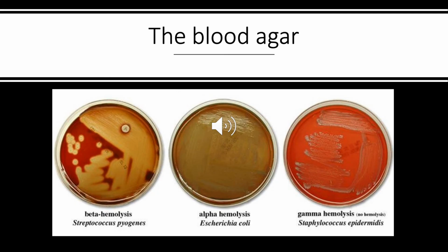Another commonly used enriched media is the blood agar, and its preparation slightly differs from the chocolate agar. We will now look at what makes a blood agar good. In the blood agar, 5 to 10% nutritious sheep blood is added in solution, and then this solution is added to the standard agar plate. It gives the agar plate a bright red appearance, which is where the plate gets its name from. There is no heating required to lyse the blood cells. If prepared correctly, you should be able to observe the hemolytic properties of various cultured bacteria as seen in the picture below.